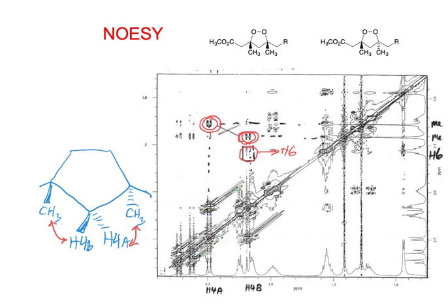It just means that those cross peaks' peak shape isn't perfect. They come down and trail off in one direction. So when you lower the threshold to cut across there, you're getting some of this tail along the peak, because that peak isn't really symmetrical.